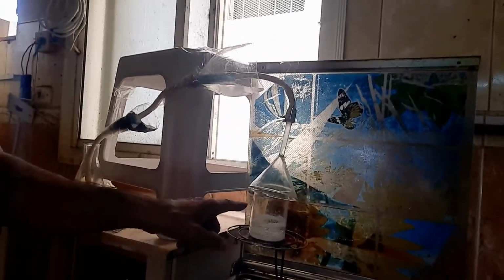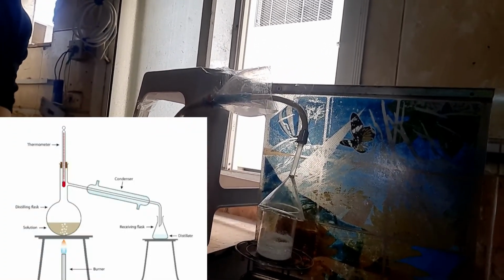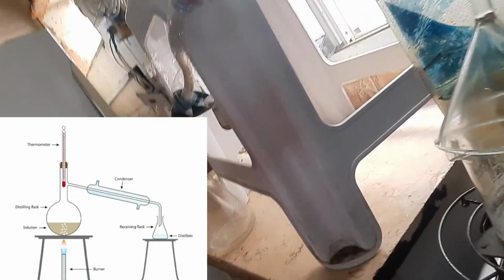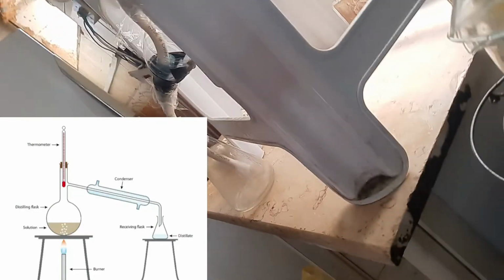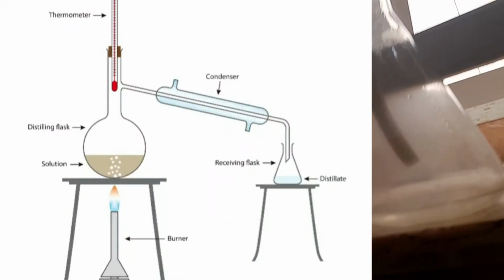Two steps are required. One is the evaporation, which is happening in this container. You can find salt is almost there. I'm going to switch off that light source, then you can find the crystals of salt at the bottom of that container. Here you can find the crystals are there, and ultimately water is transferred into this flask. So this is today's procedure and activity.